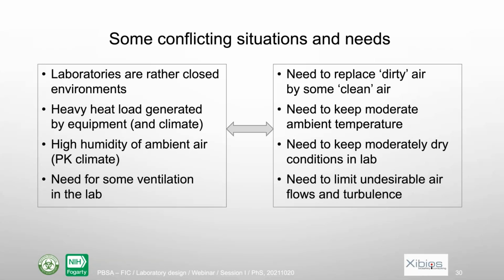Then beside the heat from the climate and also from our human activities, you also have quite a lot of heat produced by the equipment in the lab, like biosafety cabinets, like freezers, incubators, and so on. And you need to keep a moderate temperature. Also, in Pakistan, you have a high level of humidity in the air, while in the lab, the air should be moderately dry.